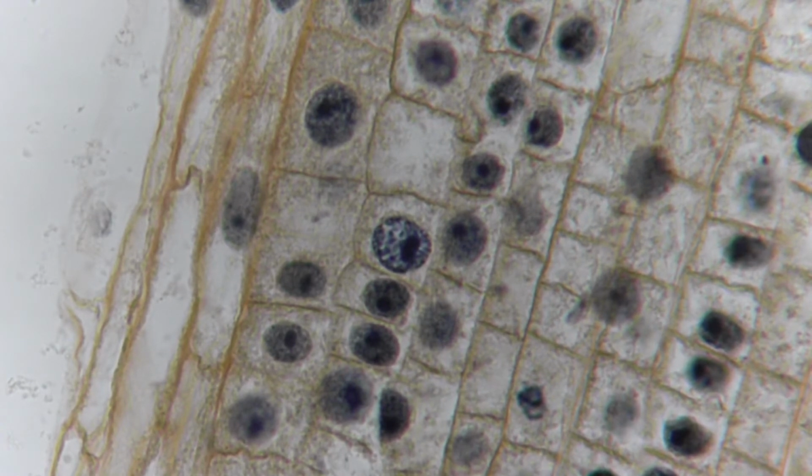I'm kind of taking it out of order here, but do you see that there's 2 right under that prophase that are a whole lot smaller than the prophase up above it? And if you look to the cells to the left, you see they're 2 or 3 times larger. And if you look to the right, you see how much larger those cells are.